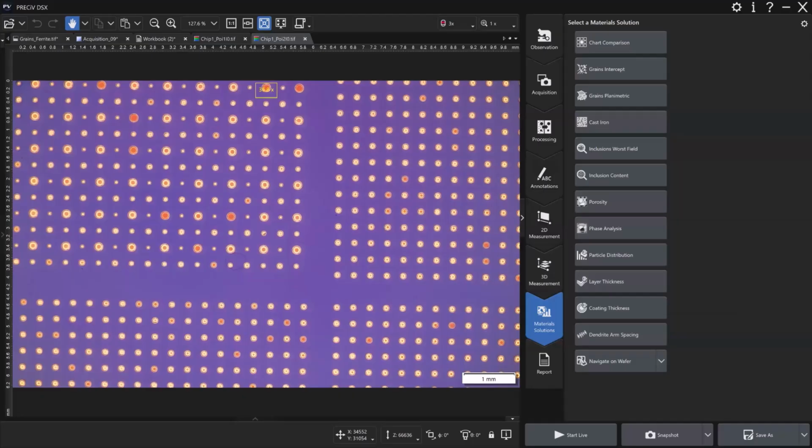which increases accuracy for your micron per pixel calibration values than just one point to point that a user does manually, if that makes sense. So the auto calibration uses contrast-based detection of the lines on a very specific standard type. And it has that capability as well.